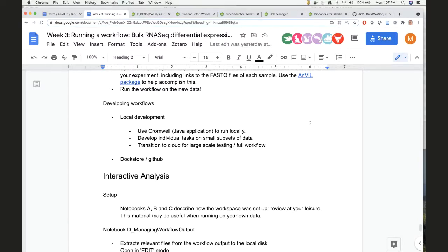And then once I knew that the script was somewhat runnable, then I would upload it into Dockstore, and then I would find little bugs in the upload process. And then I would get into AnVIL, and then I'd maybe find little bugs in AnVIL, but it definitely helps being able to work on it locally to get the big bugs out of the way, and then you kind of find little ones along the way that are much easier to fix.